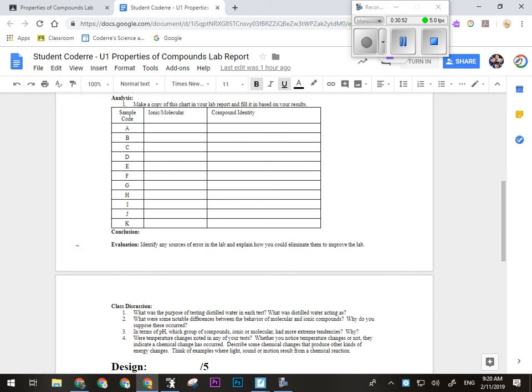So if, when this is all done, you were able to clearly identify everything, and you found that all the ionic compounds conducted electricity, things like that, then you can write what the hypothesis stated. Actually, you don't use the word me or my. The data in this experiment supports that. The data is exactly as was predicted. Therefore, the hypothesis is acceptable. Or if you don't find that, then you say the hypothesis is rejected because the data does not support it. And talk about the specific data.